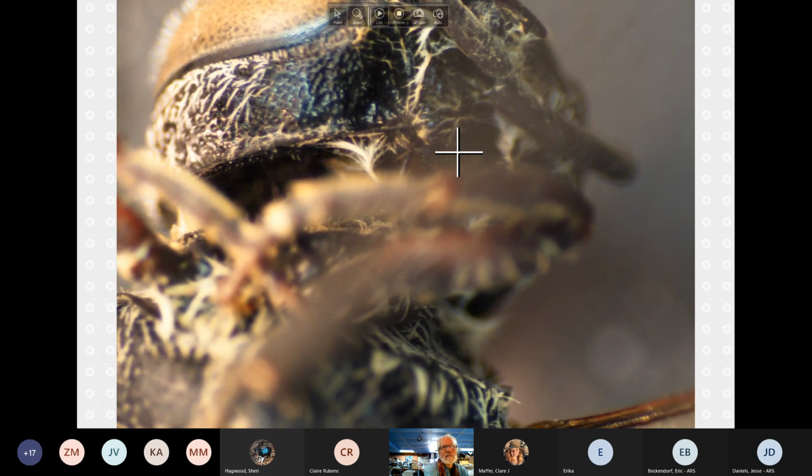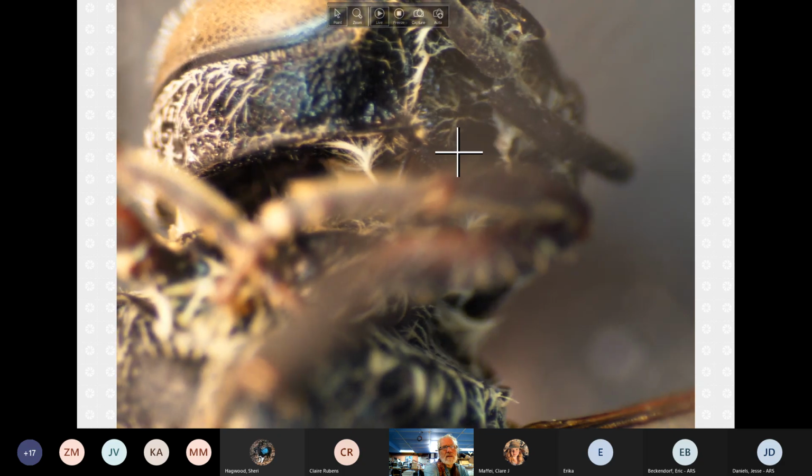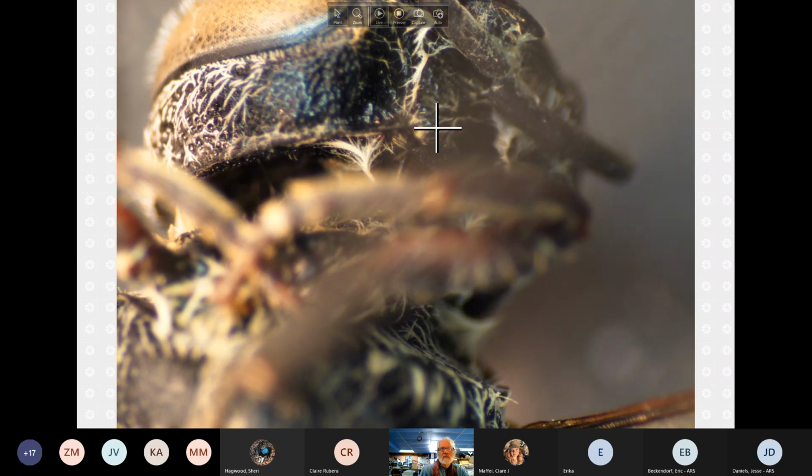Yeah, it's messy in there. Can't really see, but that's the galea of the tongue and very armored. And here's the two edges like that. And then this is this projecting tip to the both. So hopefully in the next one we'll see better.